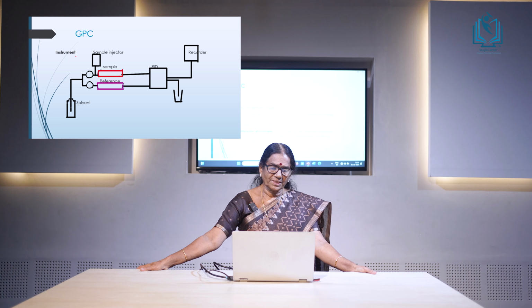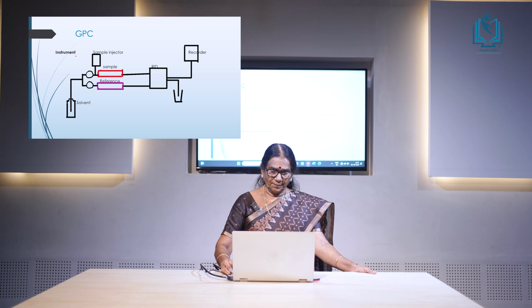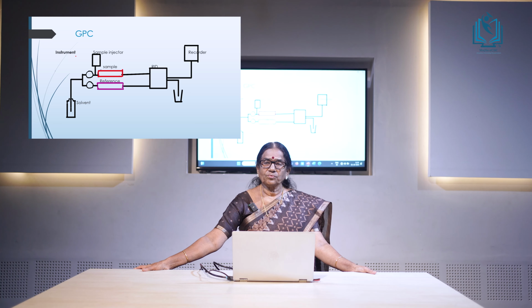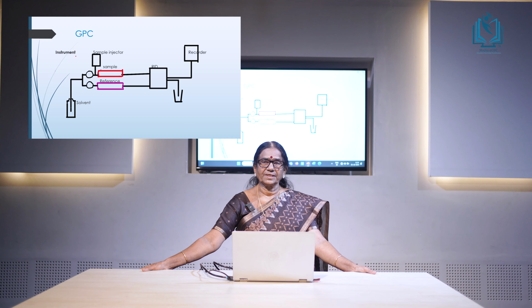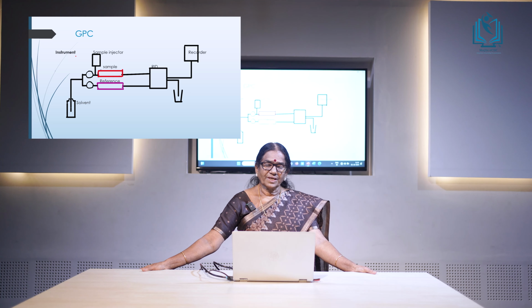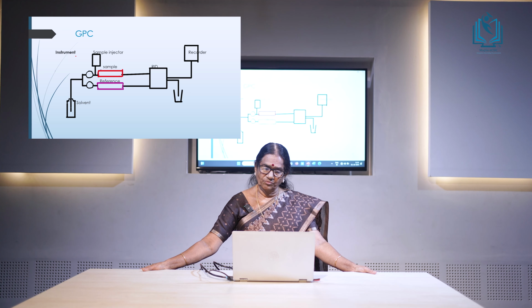Now, for the unknown sample, we have the GPC apparatus containing two chromatographic columns: a sample column for injecting the sample, and a reference column also. The solvent is pumped into the sample column and the reference column. The sample is injected into the sample column, and both are washed, or eluted, and we will be collecting different elution volumes.